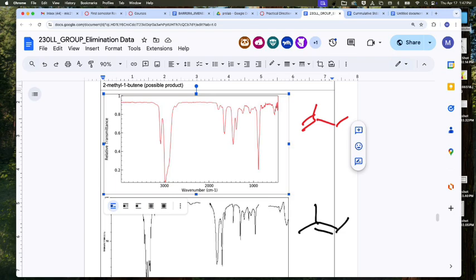Yeah, it should. Okay, what we should look at would be the hydrogens connected to the pi bond. Those are going to be the most unique. The 1-butene has those 2 hydrogens connected to the pi bond. The 2-butene has just the 1 hydrogen. Those hydrogens are going to shift the most downfield. Everything else, as far as the HNMR, is going to show up in almost an identical space, so it's going to be really difficult to differentiate those. Does that make sense? Okay.